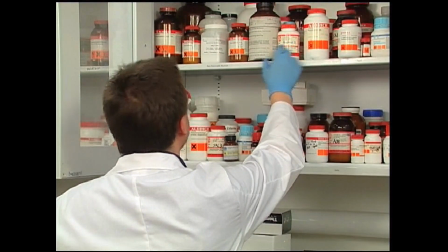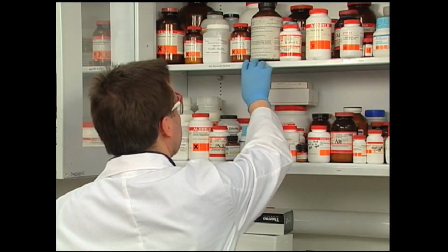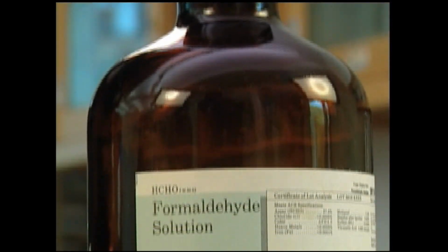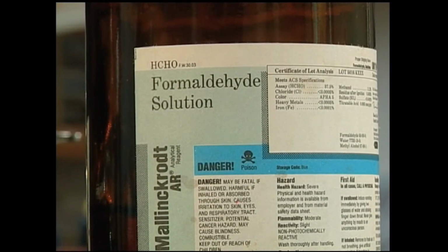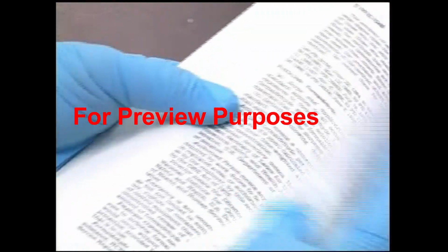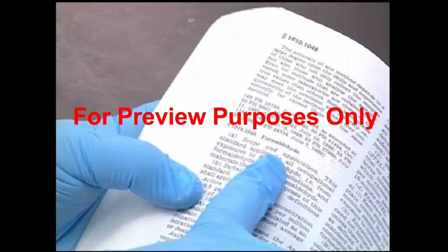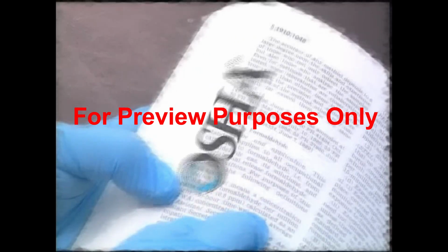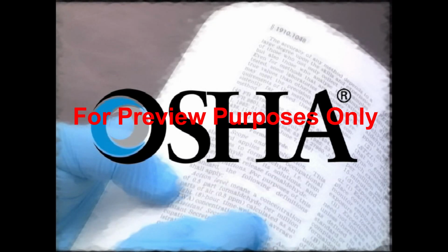In the lab, many of the chemicals that we come into contact with are potentially hazardous. Formaldehyde, a common laboratory substance, is no exception, but it is special. Health problems from mishandling formaldehyde can be extremely serious. So serious that the Occupational Safety and Health Administration, OSHA, has created a standard for working safely with materials that contain formaldehyde.